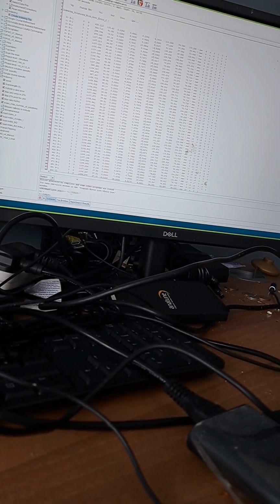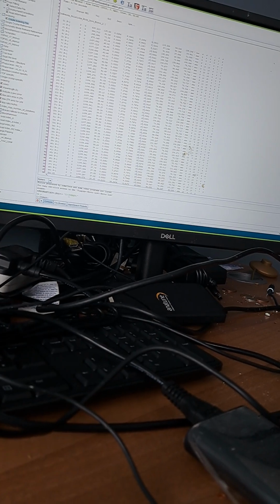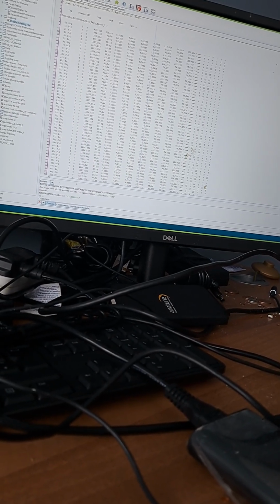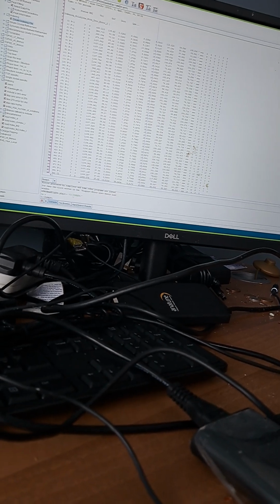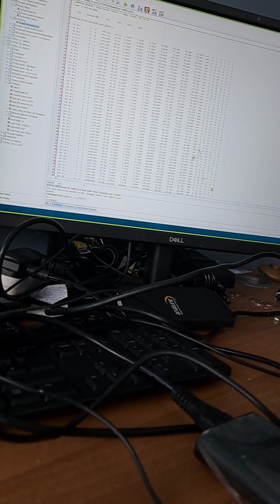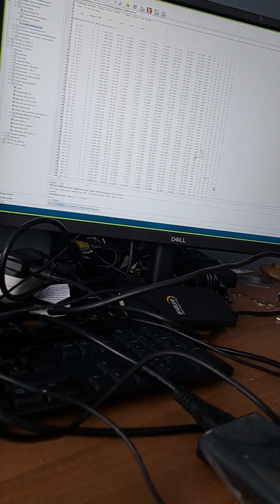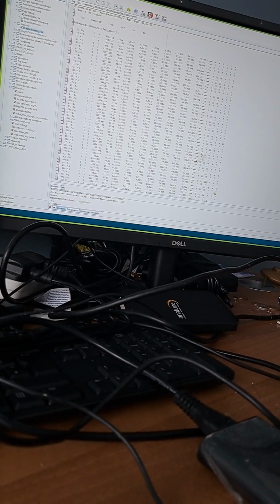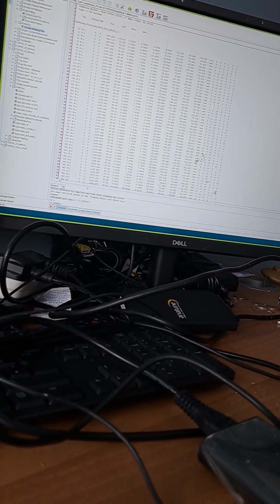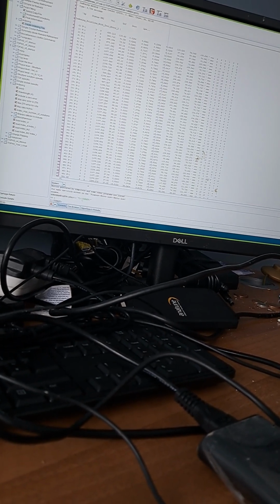So really, I would strongly suggest that you follow one of these. I think it's hydrochlorothiazide, an example in DASH. So with the solution that you have, the unit cell that you have from when we did that, you can input those parameters into DASH. You don't need to index the sample anymore. You can just put in known parameters. And if you put in those known parameters, then that gets you to the next stage.